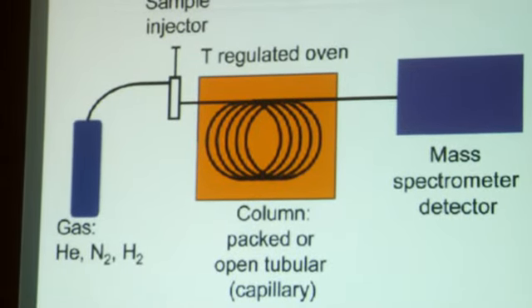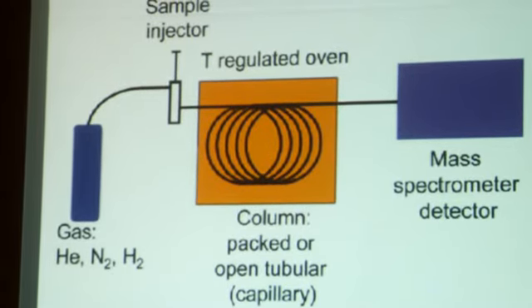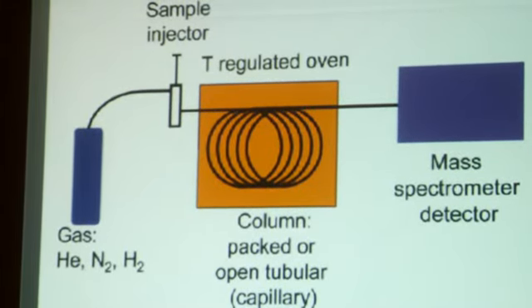Using both the gas chromatographer and mass spectrometer together allows for a much more accurate substance identification, since it's very unlikely that two different molecules will behave in the same way in both the gas chromatographer and mass spectrometer.